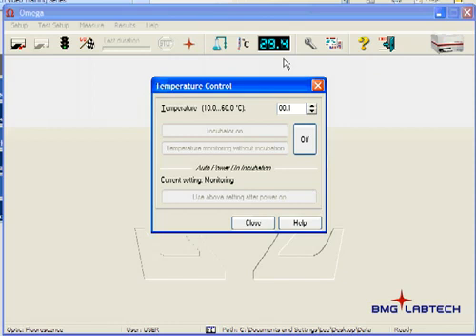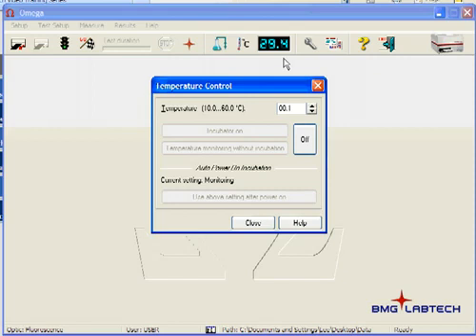In this case, it's at 29.4 but that will drop as it cools since we had set that temperature just a second ago.